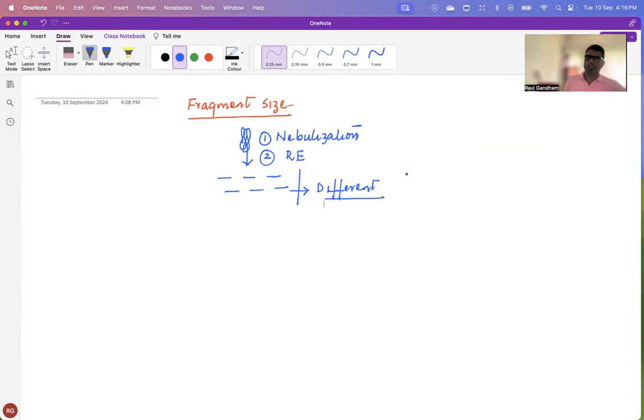Why do I say lengths of fragments? Because here there is only a possibility of selecting a range of lengths. So you take all these different sized fragments, and then select your fragment of interest. So first you need to understand how you estimate your desired length of fragment to be selected for generating your specific read length. First, let us talk about if you want to generate 2 into 75 base pair reads, not fragments, sorry. You want to generate 2 into 75 base pair reads.